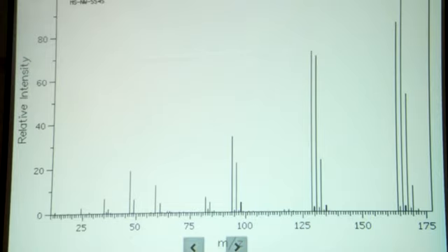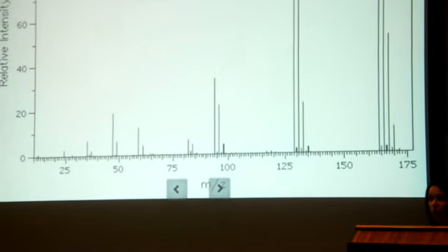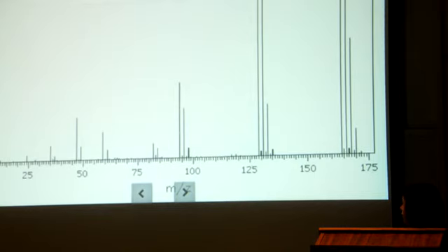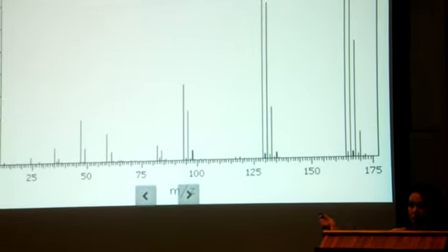All of these lines are degradation products or fragmentation lines. So they're all fragmentation products from the reaction. There's also some isotope lines that we won't really have to worry about. That's getting a little hairy. But if we consider a degradation product, we know that TCE is a degradation product of PCE. TCE has a rough molecular weight of 130, and we'll see that line right here. So this is how we're going to be able to determine what degradation products we have throughout our reaction, and that's essentially what we're doing for our data analysis.